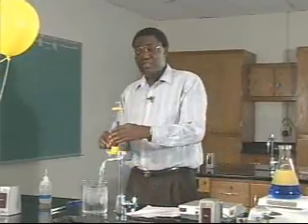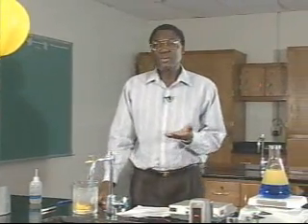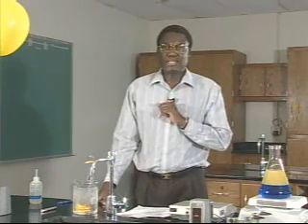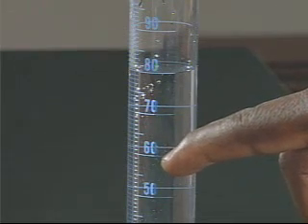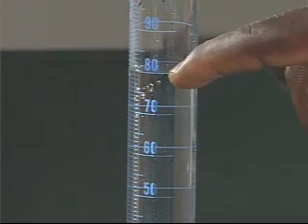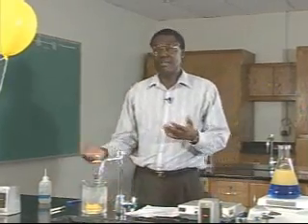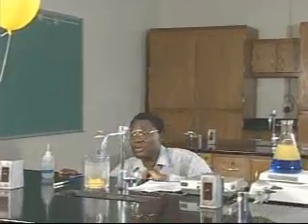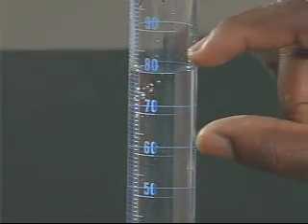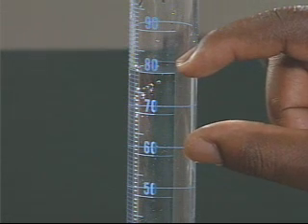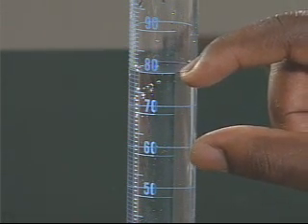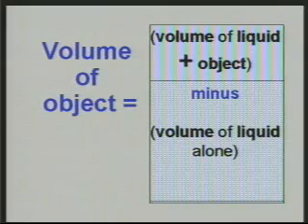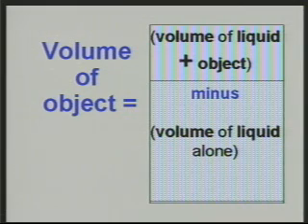Once your object is in the measuring cylinder, you'll notice the volume has increased because something else is now in there. Read the new volume again, avoiding parallax by getting your eye level with the bottom of the meniscus. You will have two volume readings: the reading before you placed the object in and the reading after. The difference between the two readings gives you the volume of the material.